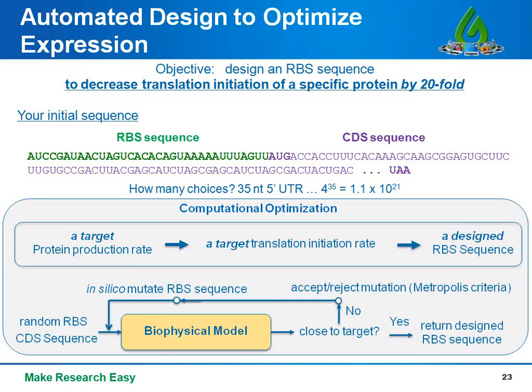And if you want to manipulate that 35 nucleotide 5' UTR region, there would be a very large number of possible variants that you would have to try. So obviously you don't want to spend the time screening 4 to the 35th variants. Instead, you can use computational optimization to find 1 or a small number, maybe 5 variants that you would like to test in the wet lab.